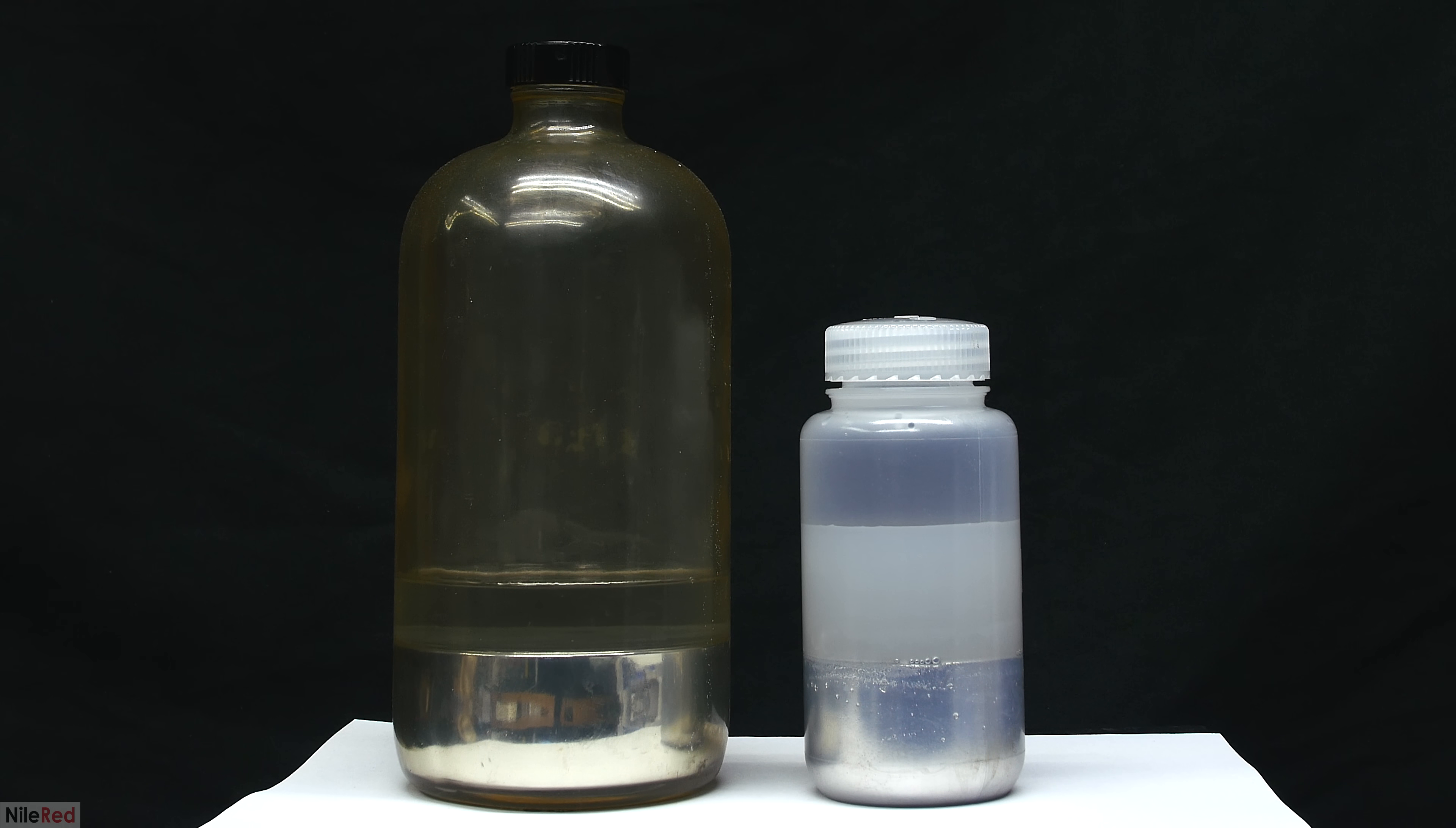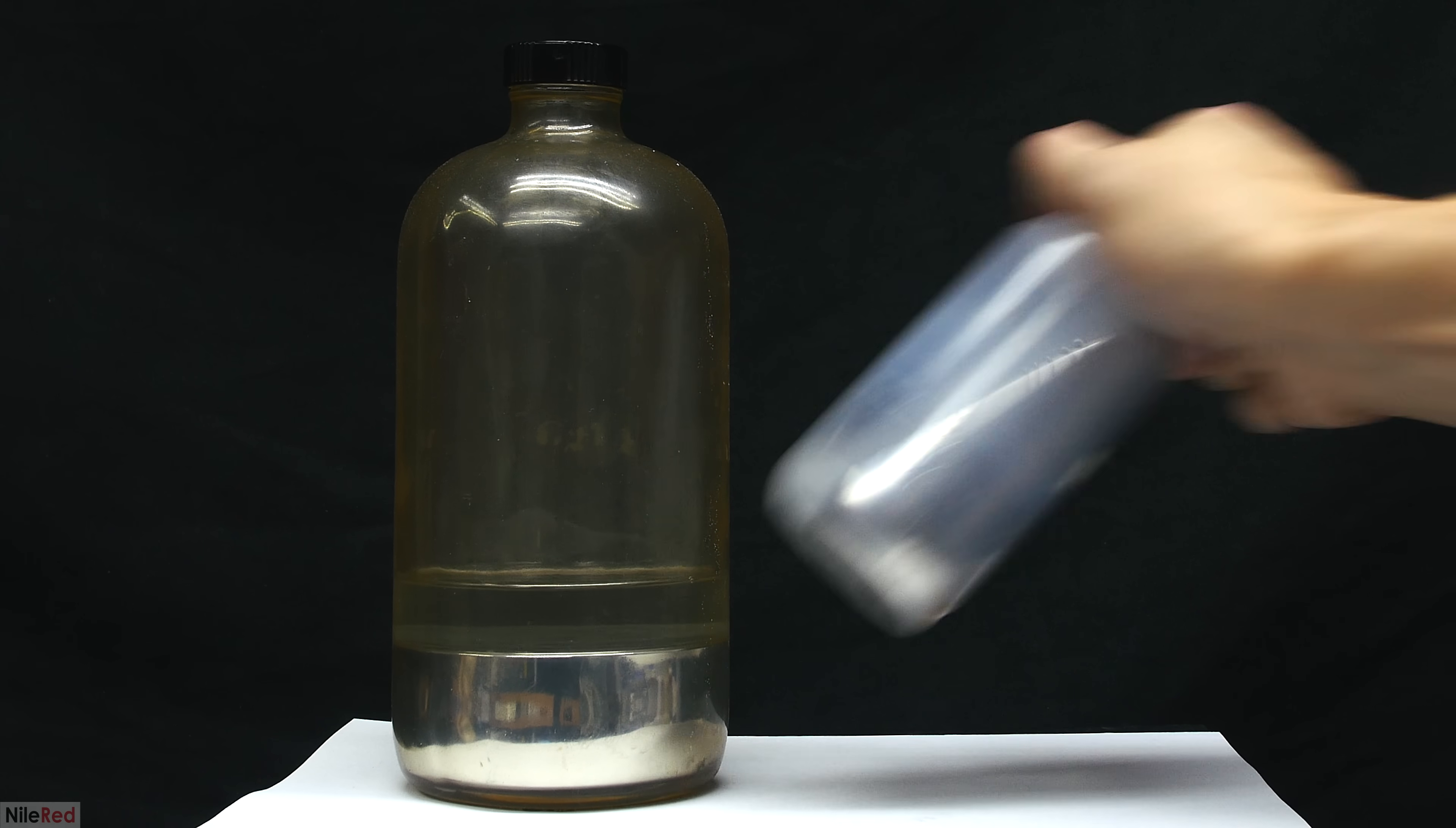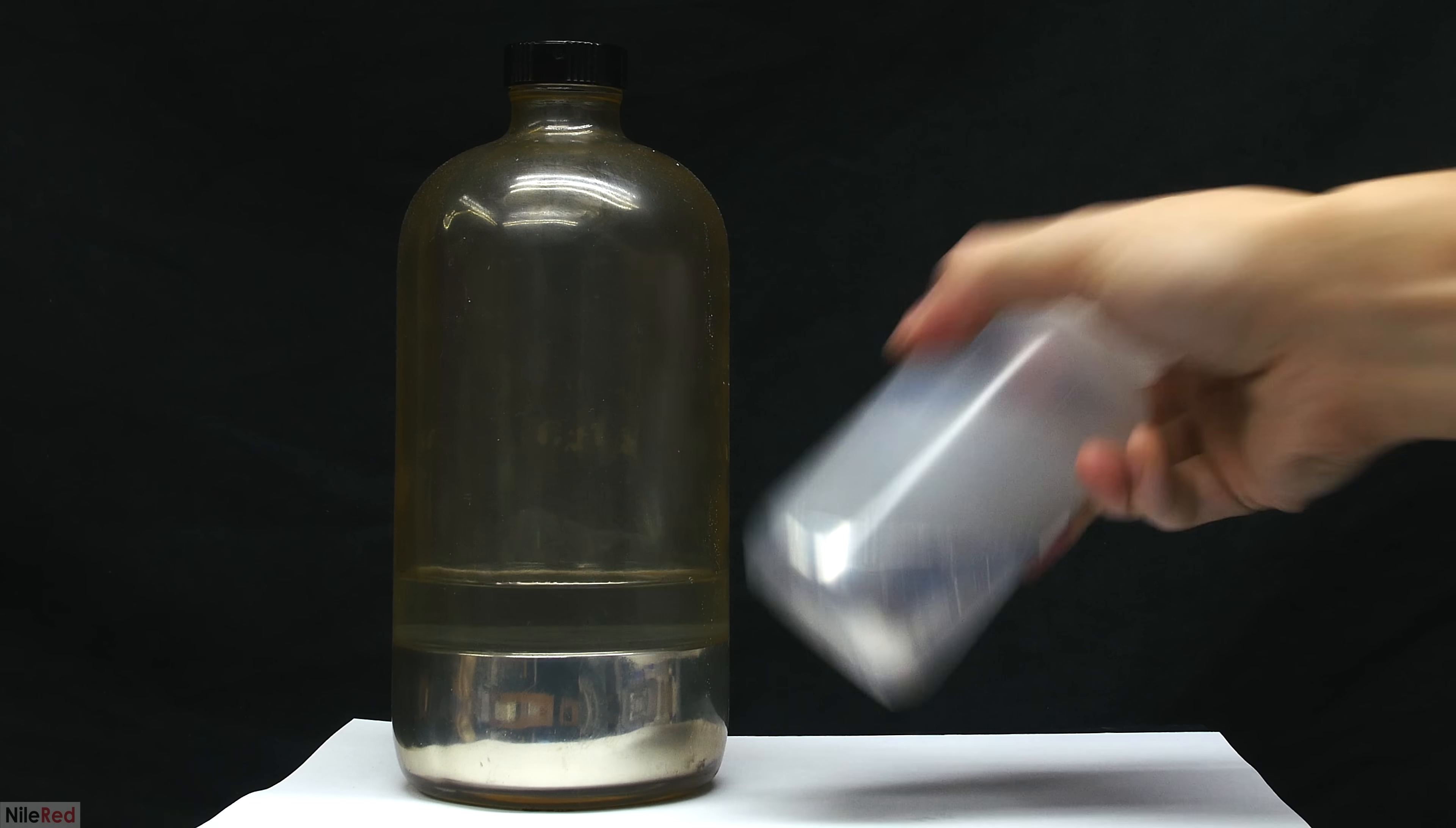The mercury that I'll be distilling today is actually from two separate sources. The stuff on the right is what I cleaned in my previous video, and since then, it somehow got oxidized and dirty. The mercury on the left was received and cleaned much more recently, and so it still looks pretty good. The liquid that you see floating above the mercury is just water, and it's used to keep down the mercury vapors.